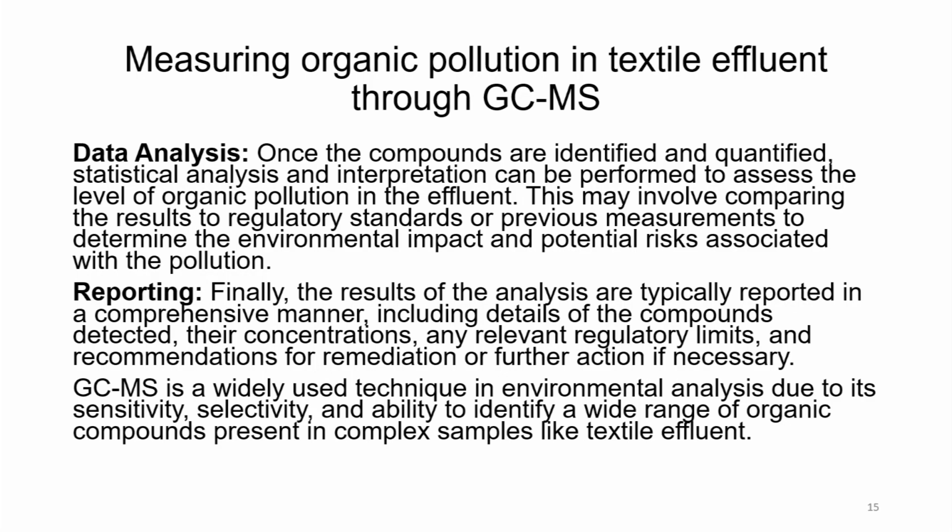This may involve comparing the results to regulatory standards or previous measurements to determine the environmental impact and potential risks associated with the pollution. So, either it can be compared with other known compounds or it can be searched through the library because of the mass fragmentation pattern matching.